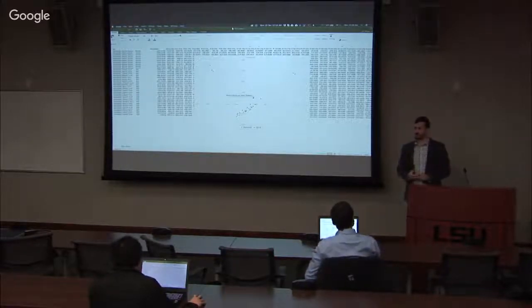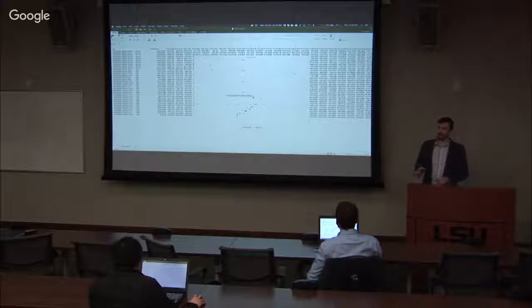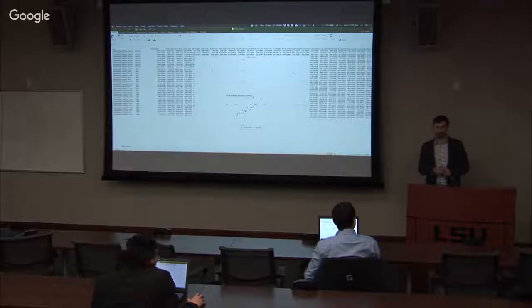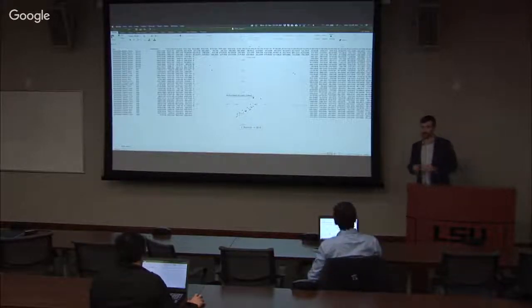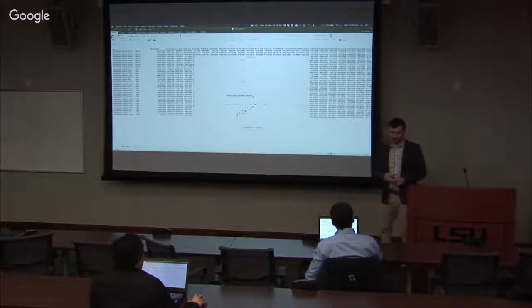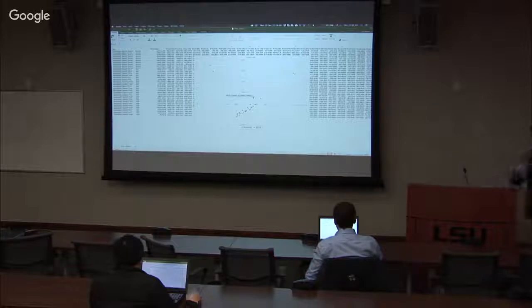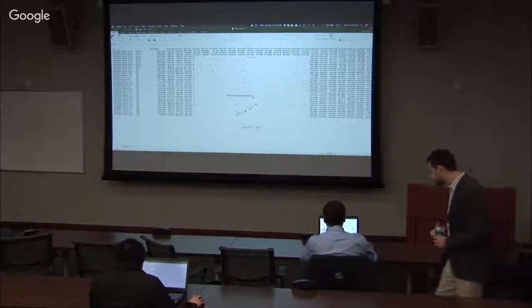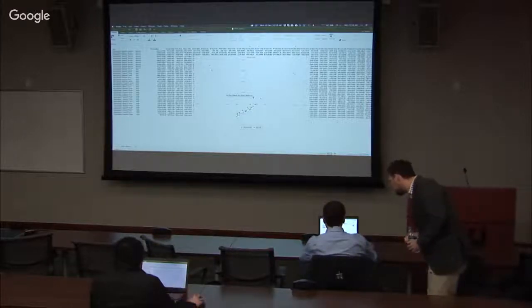Did anyone succeed at creating the normalization pipeline? Yes? So a few of you have. When I tried to pull it up on the website, there's some issue where it won't let you scroll down to actually do PCA. Can you see that? Yeah, sure. So here, this is the utilities. Upload.